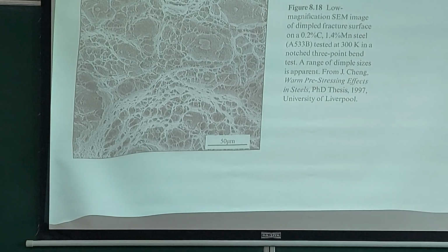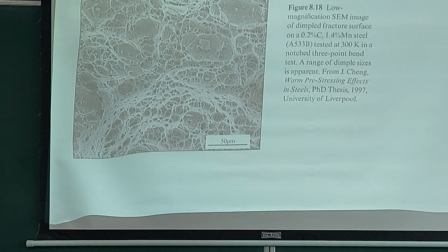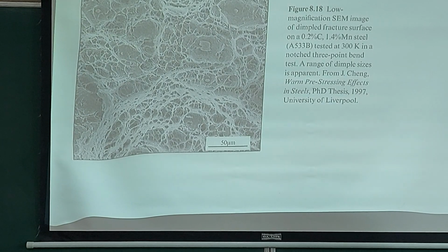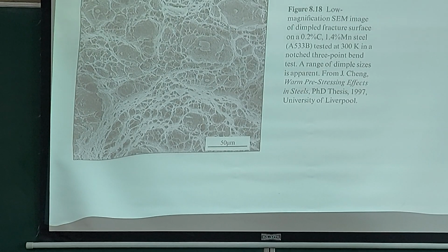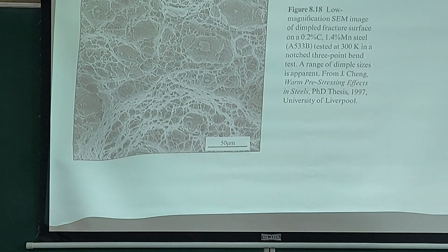Because it is a fractured surface, it is also very important where you take the picture. If you take the picture close to the crack origin, then it will tell you more about the material's property, because if you are far away from the crack origin, then the loading conditions might have been different.